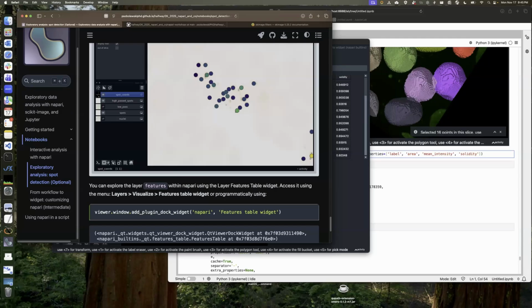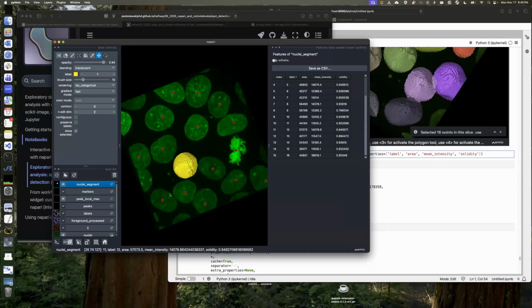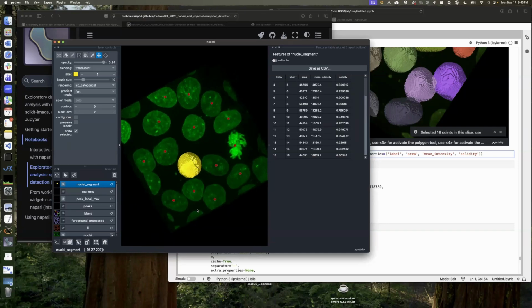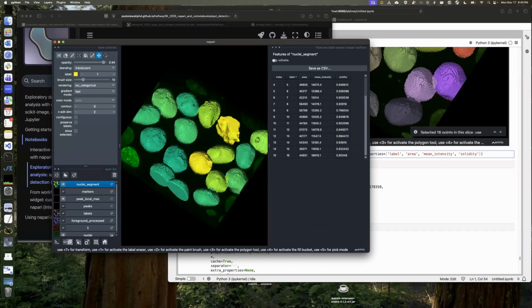How do you create a selection in 3D? So in 3D, what are you trying to select, Miriam? Because in this case, I can select the individual labels by clicking on them, and you see that they are selected in the table.